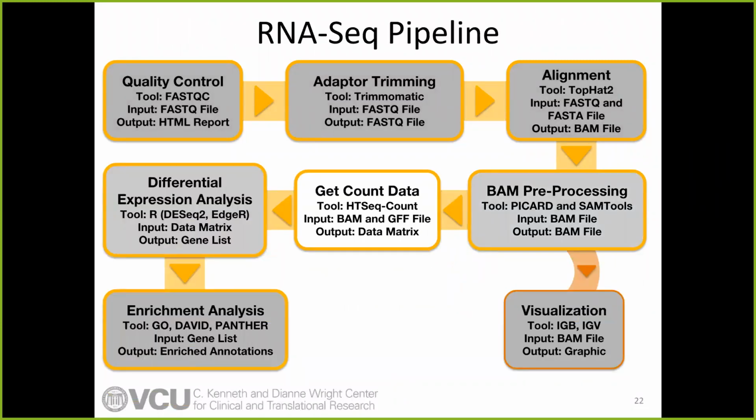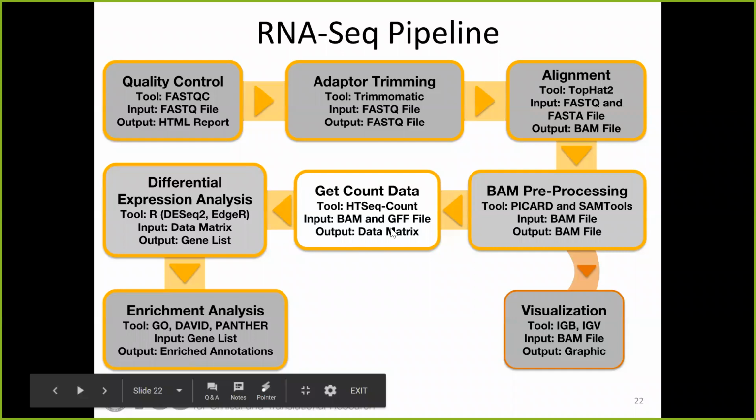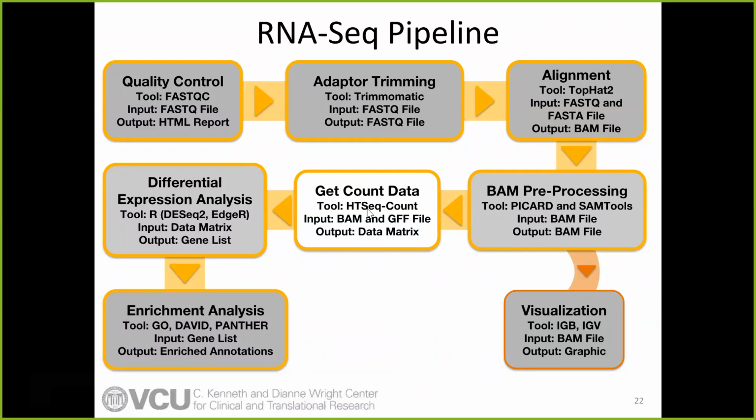Okay, with RNA-Seq data, generally a lot of pipelines will go through getting count data for your genes or whatever features that you are trying to figure out what the expression is.